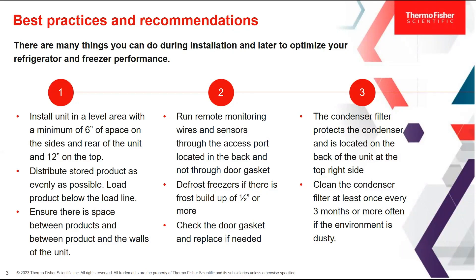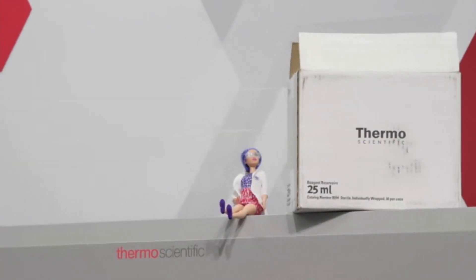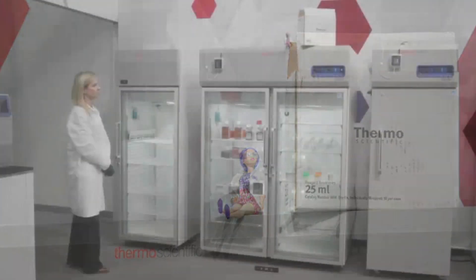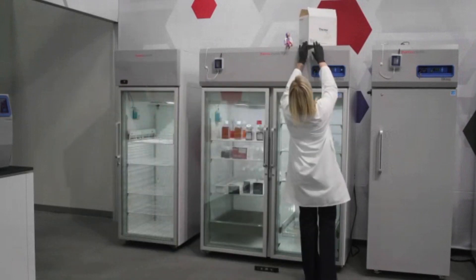It's important to install these units on a level area with a minimum of six inches of space on the sides and the rear of the unit and twelve inches on top. Going to the immersive lab, you can see we're checking to make sure that Dr. Roberts has the proper space between the units and above as well. It looks like there's a box on top of the refrigerator which impedes the clearance on the top, so we want to remove that.